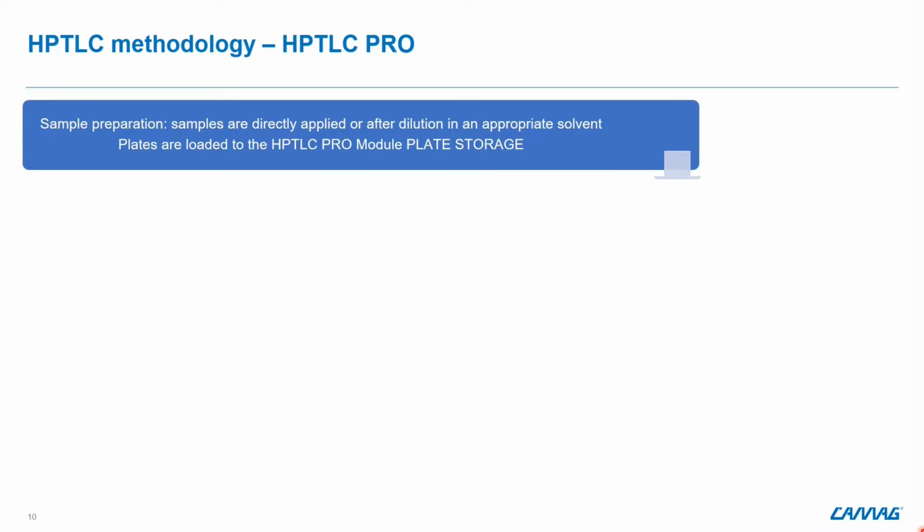On the next slides, I will present you the analysis of lipids used for formation of liposomes and lipid nanoparticles. The HPTLC methodology is simple. Between 15 and 20 sample tracks can be applied as bands onto one HPTLC plate without cleanup or enrichment. After development, the plate is sprayed with a fluorescent dye and the fluorescence is measured in the detector.